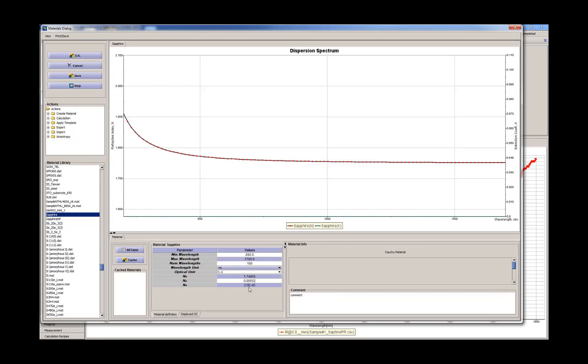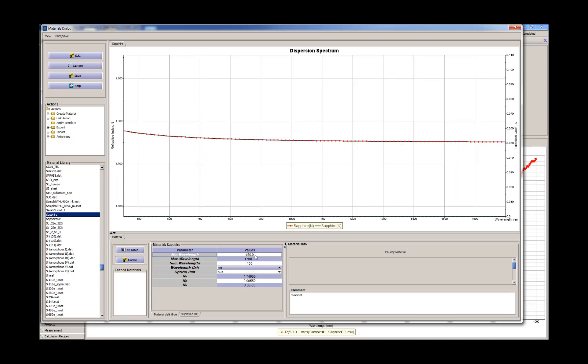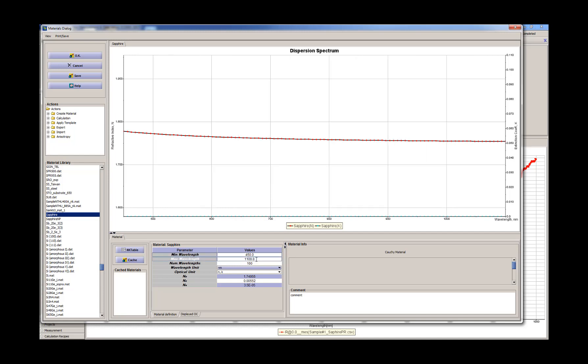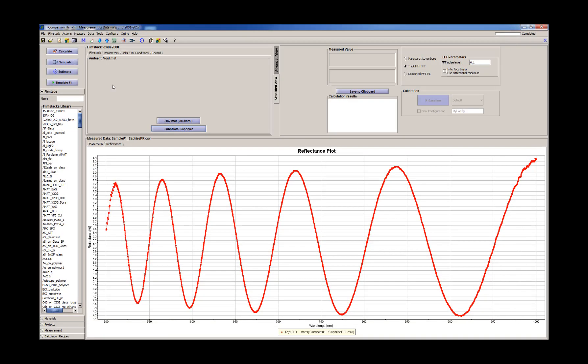It represents it using Cauchy approximation and we'll adjust it later. So now we'll adjust the wavelength range to match our measurement data.